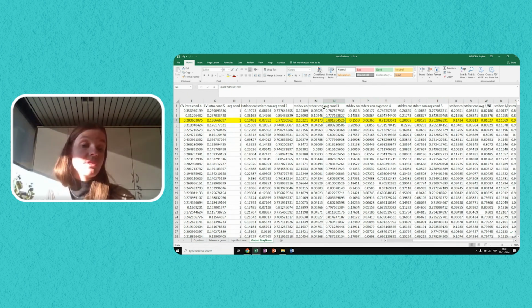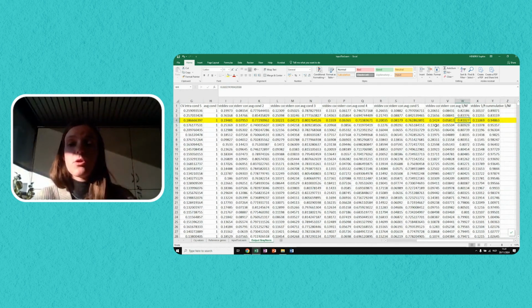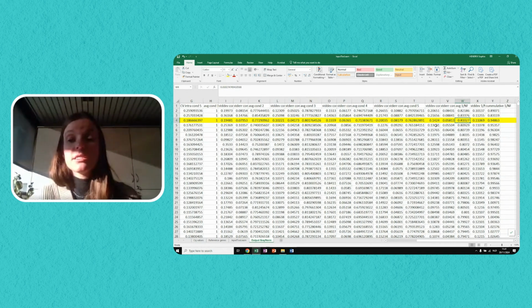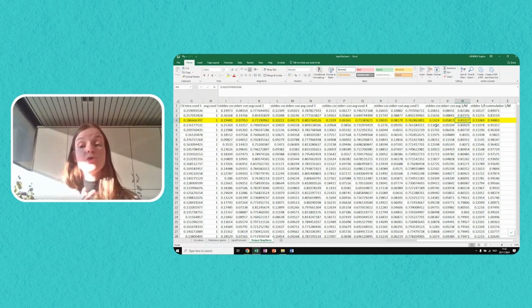And then you can also see that within each condition, the software also calculates standard deviation and the standard error. And then what it will also calculate is the average ratio of 1 over the normalization factor, which is the average value that you will multiply the RQ values of the gene of interest with in order to normalize them.